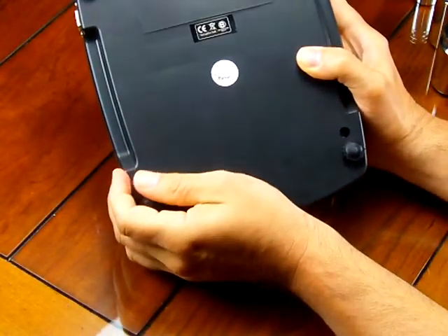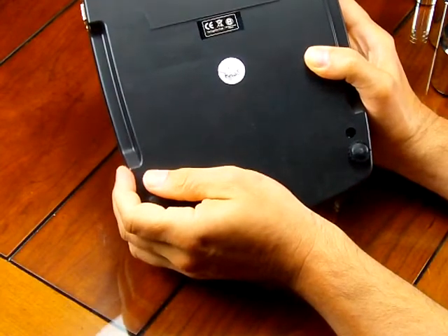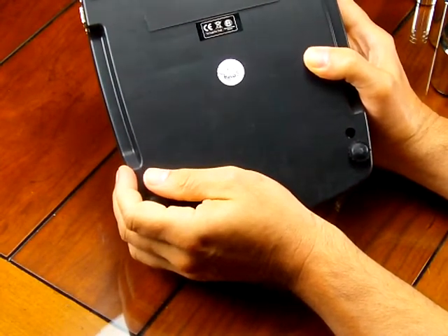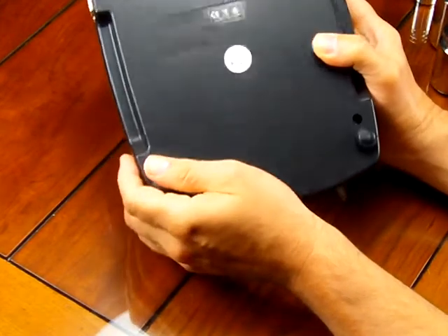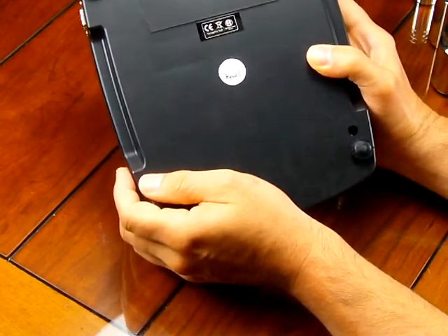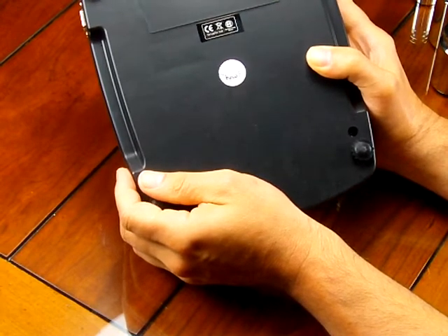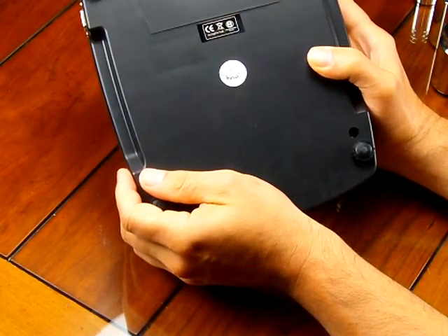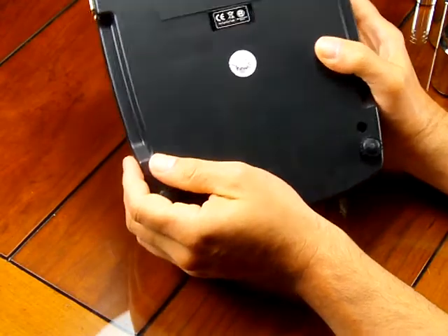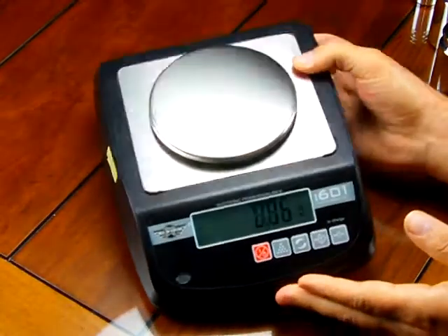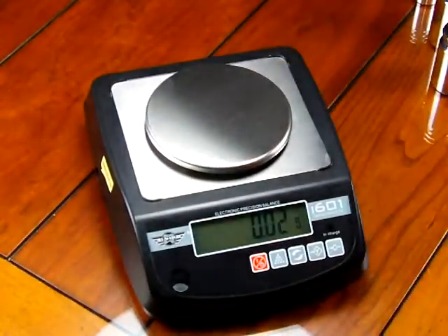making the scale available for field use when you do not have an AC receptacle. It's also good if you're in a science classroom. You don't have to go looking for all these receptacles. If the scales have been powered up and recharged, the battery has been charged, you're all set. The students can take these scales, put them on their bench, and start their chemistry or science experiment.